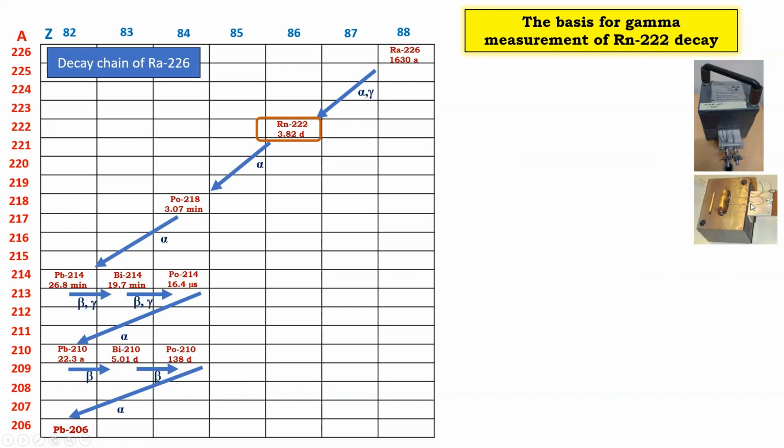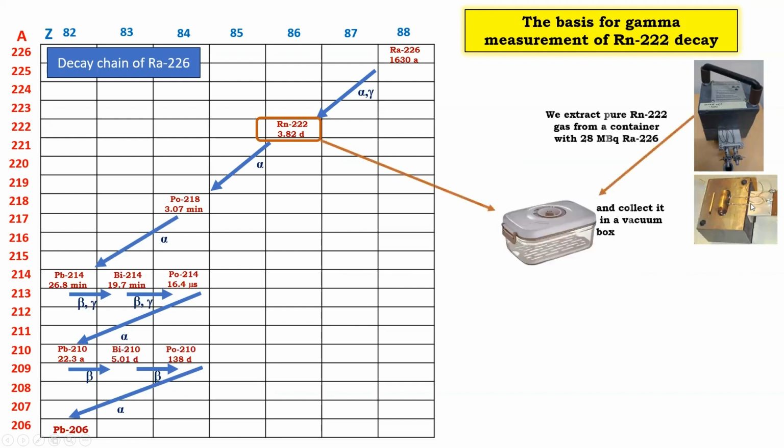Why do we have the tubes? Through these tubes, radon can be extracted. And to this end, we can use a vacuum box like you see here. Now, if we create a vacuum in this box and connect the box via a tube to one of those tubes, then radon will be sucked out of the flask and caught in this box.